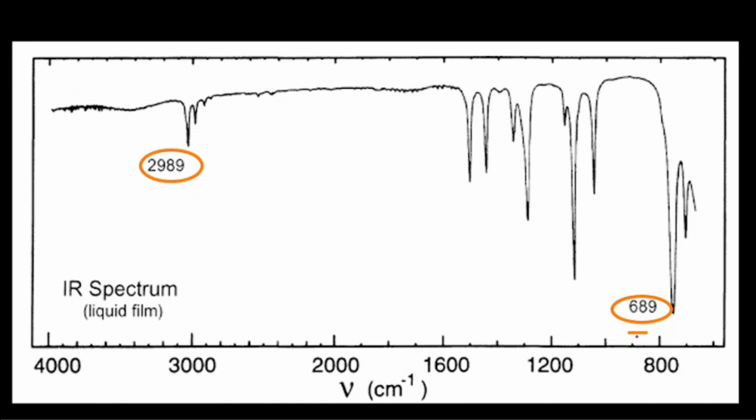In the IR, these values represent that either the C=C bonding is present here, or the halogen group that is attached with the carbon. The peak here represents that either the C=C bonding is present, meaning a double bond is present, and in the range of 1600 we are seeing no peak. It means that C=C is not present. The other thing it represents is that the C-X bond is present in your structure. Yes, it may be possible that a C-X bond is present, because the C=C bond also gives us a peak in the 1600 region, which is absent.